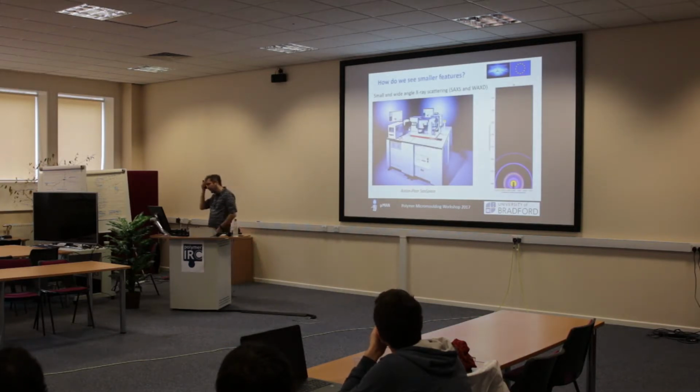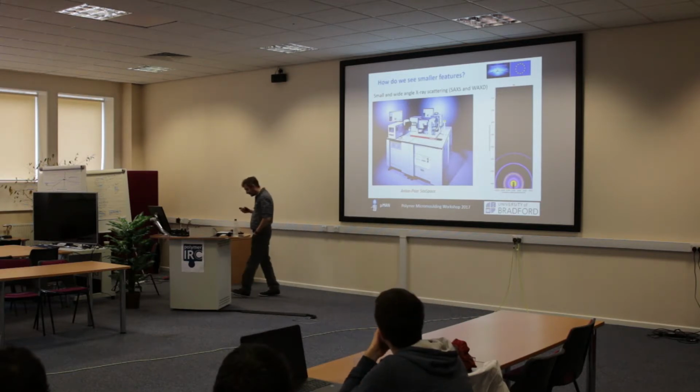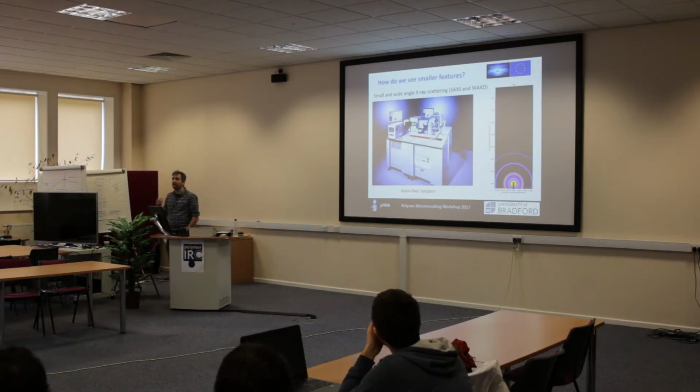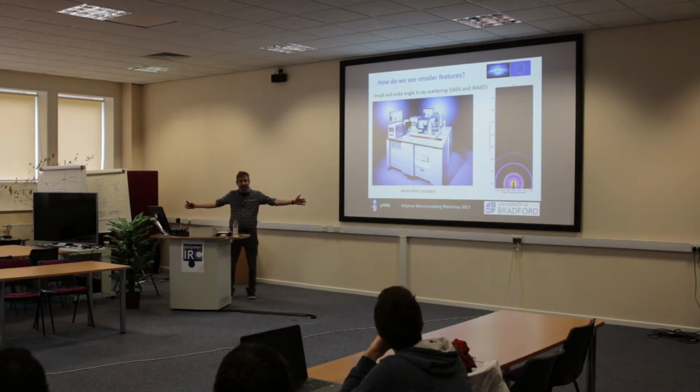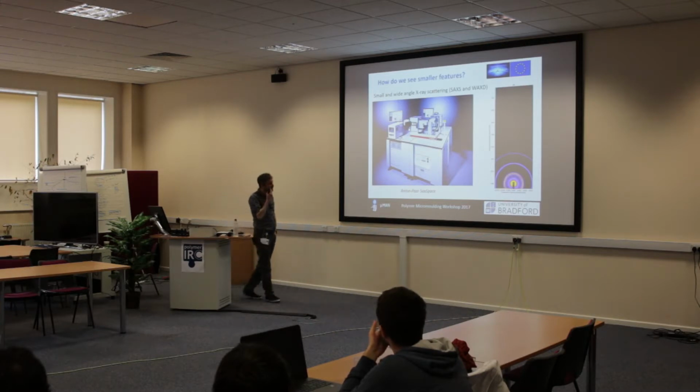And the way that we can do it is using a different method. And this is X-ray scattering, which you may have come across before. This is the kit that we use upstairs. This is going to be very brief, this part. We have a benchtop X-ray kit here, and it's fine for understanding crystal forms. It's not fine for understanding how crystals actually form, because it's the size of this. If we want to understand how crystals form, we need to use other techniques, and I'll show you how we do that. But this is the one we'll play on today for a little bit.